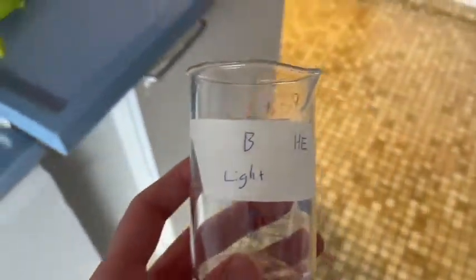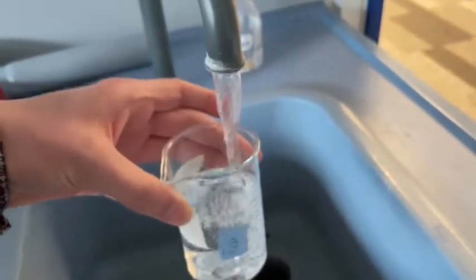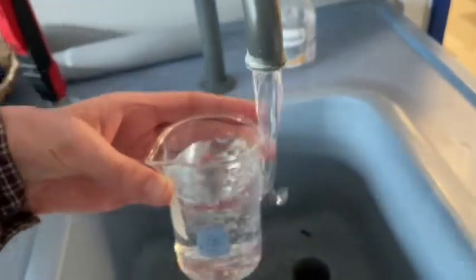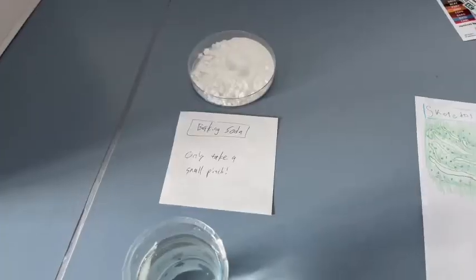After students have labeled their beakers, they can go ahead and just fill them up with water to about the top part there.